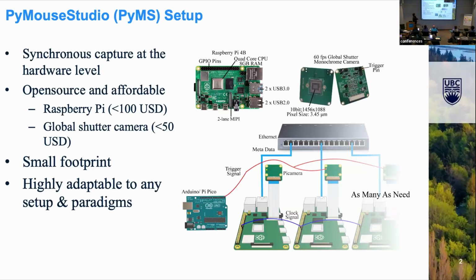So one of the tools we developed is based off of Raspberry Pi. So we use these kind of affordable cameras as single board computer solutions to take scientific images. These are very cheap and very small. We can fit them into many facilities and collect data at scale.